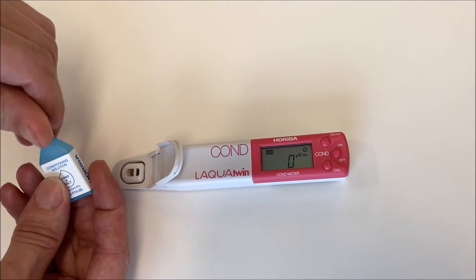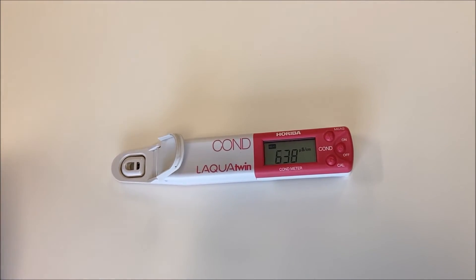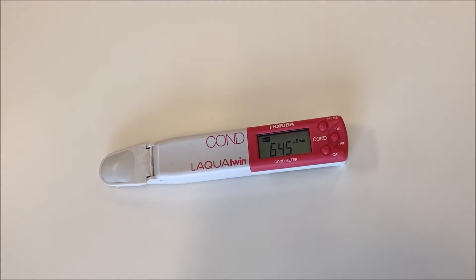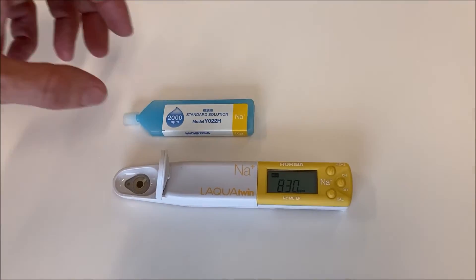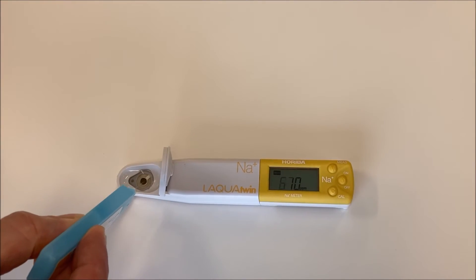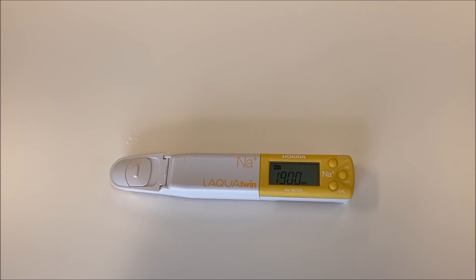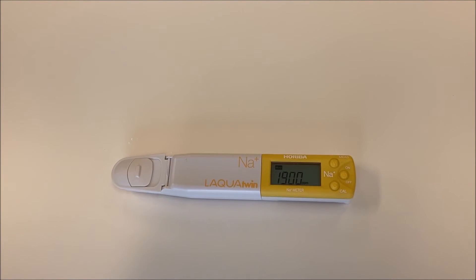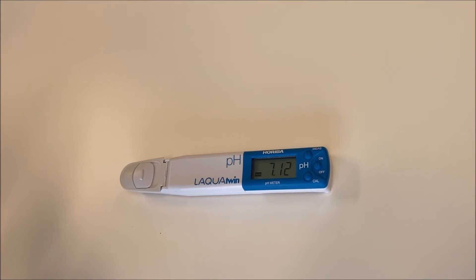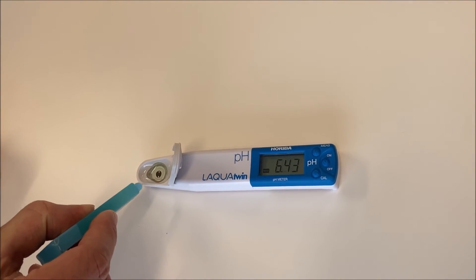To condition the conductivity meter, Horiba recommends using the conditioning solution provided, or water with 5% soap. To condition ion meters, we advise using the highest concentration of calibration solution at 2000 ppm, which is provided with each meter. To condition the pH meter, Horiba recommends using the pH 7 buffer, or water with a neutral pH.